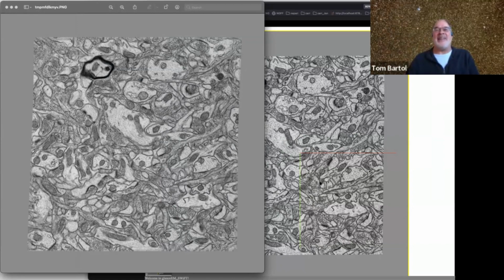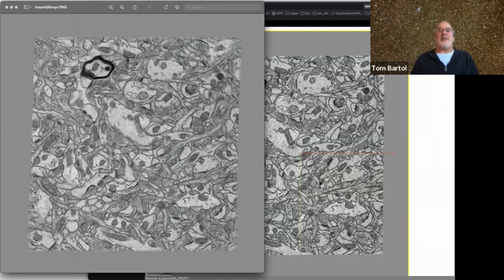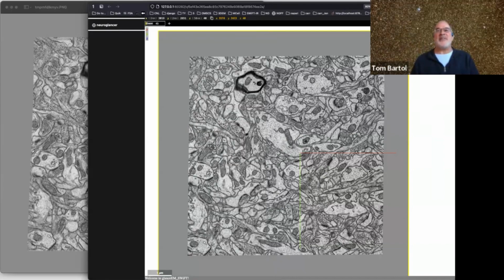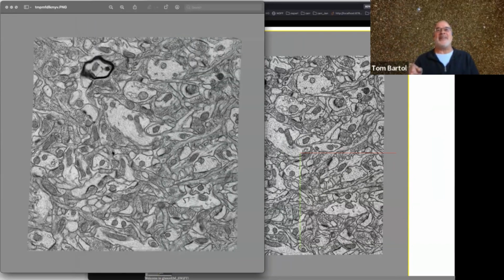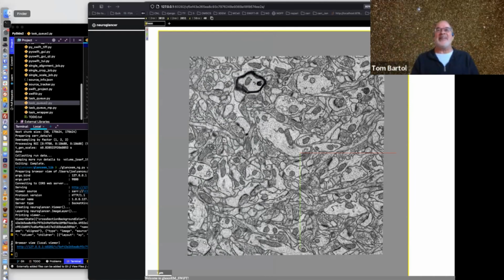I don't know why they chose comma and period. And I don't understand why you need two anyway, because you're just going back and forth between two images. Well, no, the dot goes forward and then forward again and then forward again. I see, so it's a page up and page down. Yes. But we could make one key that just flickers between this one and the next one.